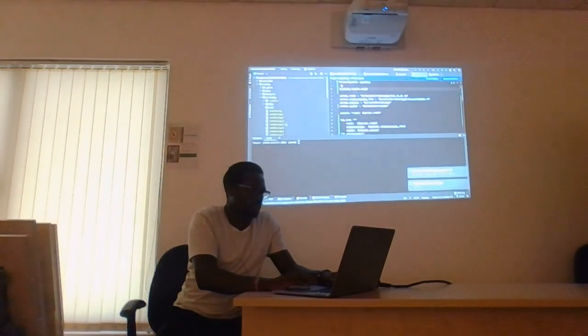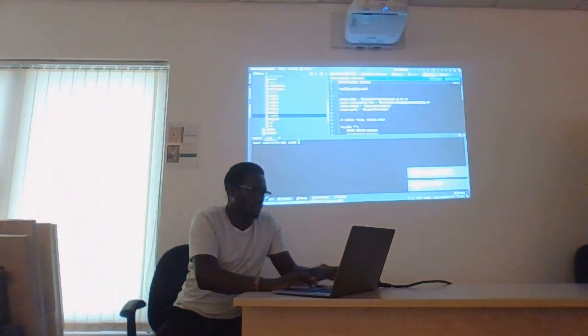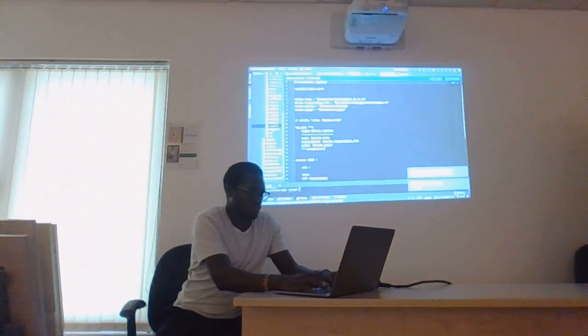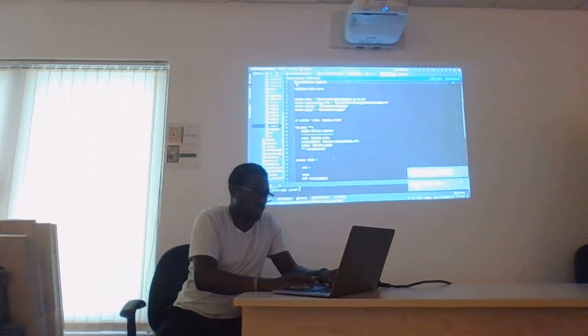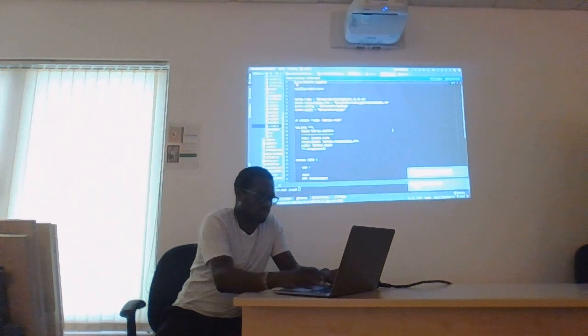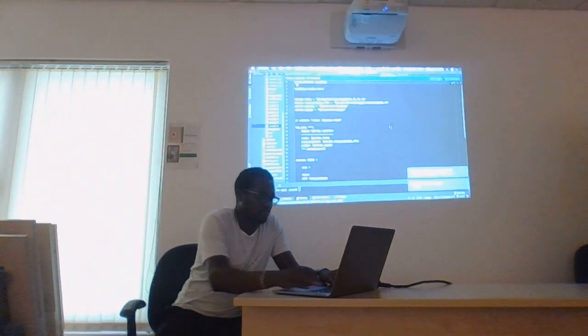Let me see. I want to zoom in here. Or is it I need to zoom in? Control shift mouse. Little mouse. On this. Yeah? view? Uh-huh. Yeah.